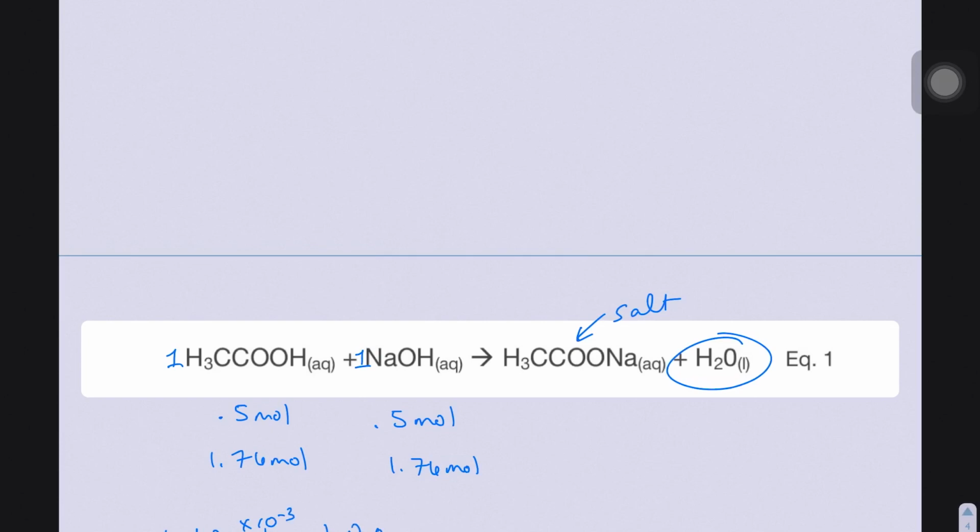That's what I added in my calculations. Yours might be slightly different. Times the molar ratio from the balanced chemical equation. 1 mole of sodium hydroxide for 1 mole, I'm going to call this acetic acid, AA. 1 mole AA, moles of NaOH cancel out, and I can do this calculation in my head. I can multiply by 1 pretty well.